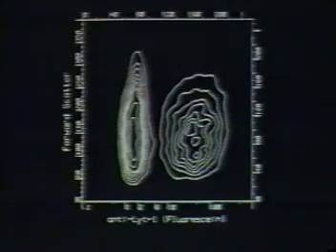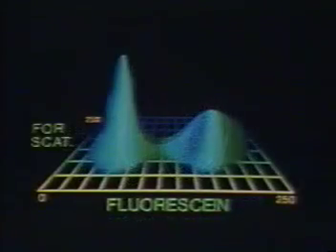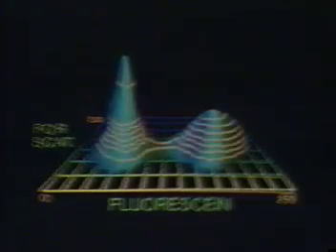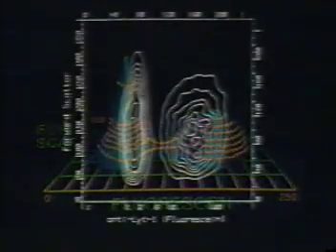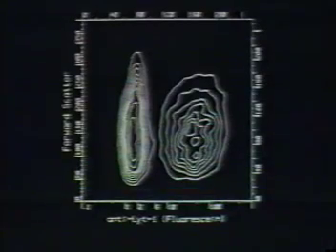It is important to understand the relationship of a contour map to a data landscape. Imagine a set of parallel lines that circle the mountain range at specific intervals from the base up. Then imagine yourself flying directly over the mountaintops and looking down. As the contour lines project into a single plane, the resulting illustration is a two-dimensional contour map.